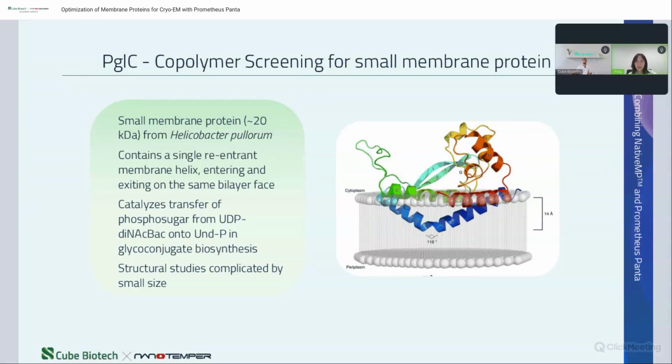And this means for a protein like PglC, even with a perfect nanodisk, we will probably still have to add a mass-increasing binder like a nanobody, a Fab, or some scaffold protein to make it visible in the cryo-EM and maybe also traceable during processing, right? Yeah, absolutely right. You need something to train your algorithm on, something to attach to and align your particle, and also you need a certain size. 60 kilodalton is right now the threshold, and then a Fab or a nanobody or something which increases the size over the threshold is the way to go.